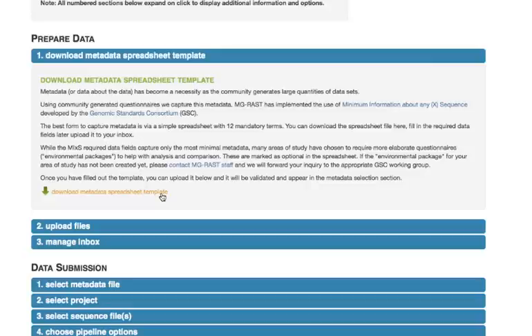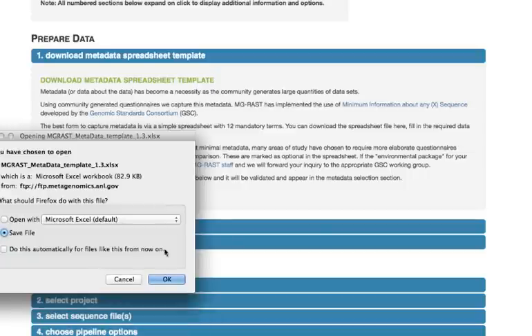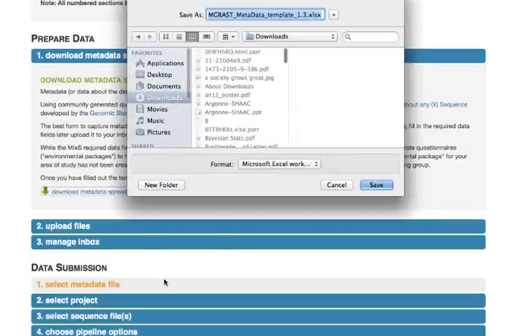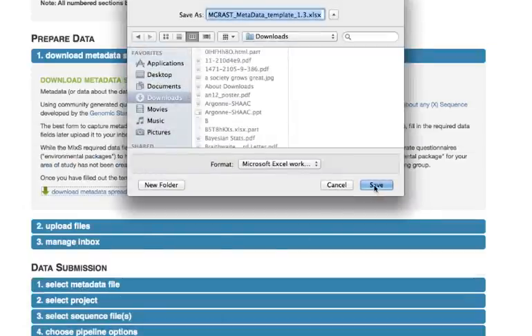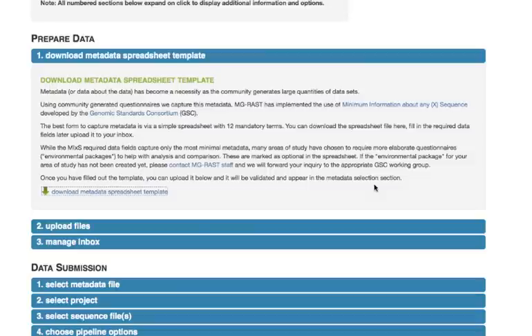The template is occasionally revised, so please download a new copy every time you submit a job. For the same reason, you may notice minor variations in the current template version from what is depicted in this video.